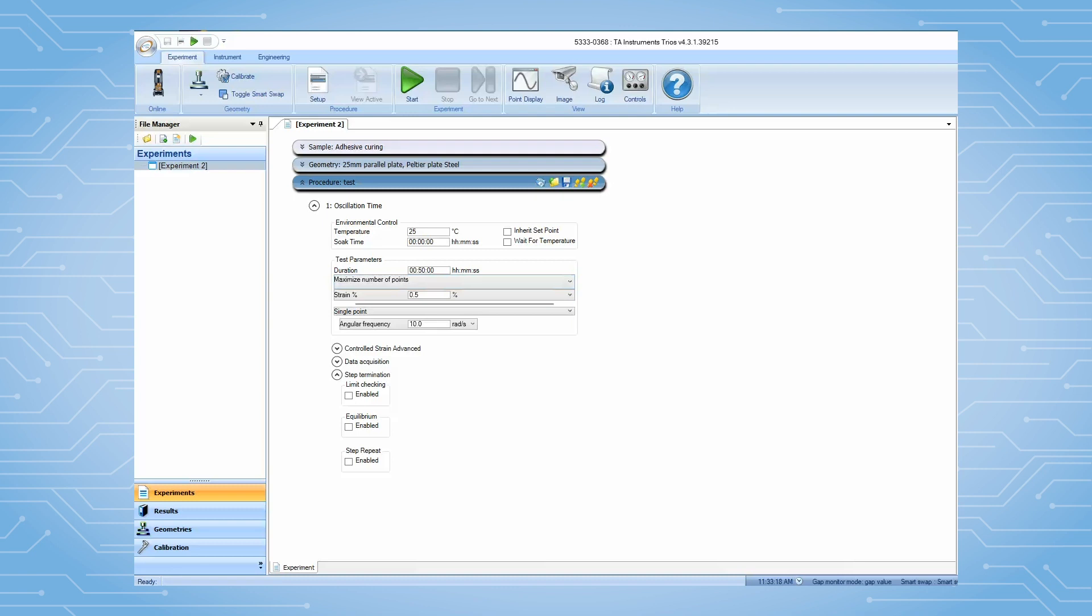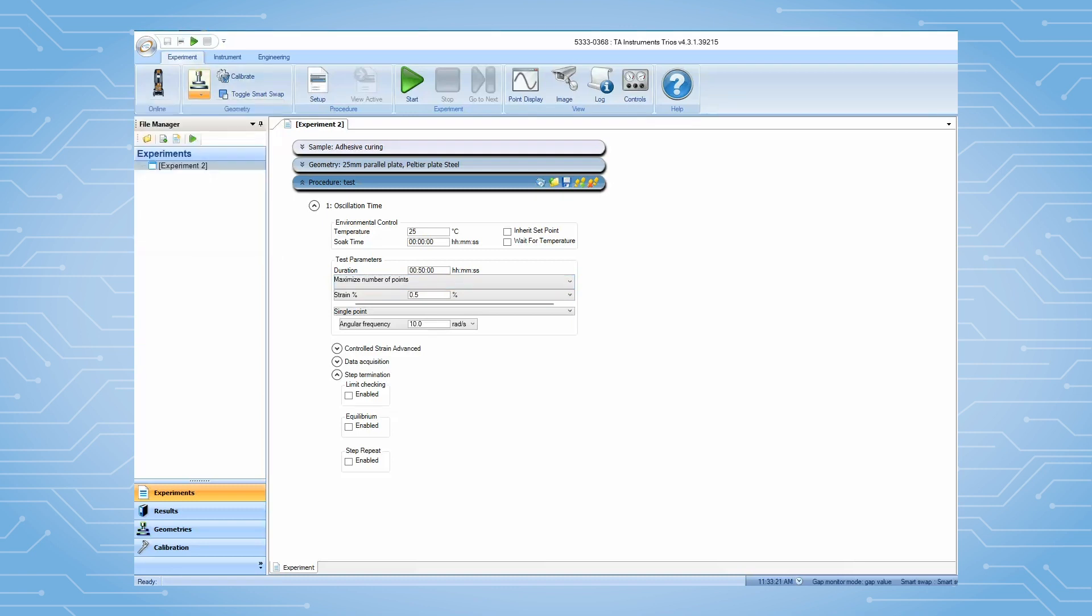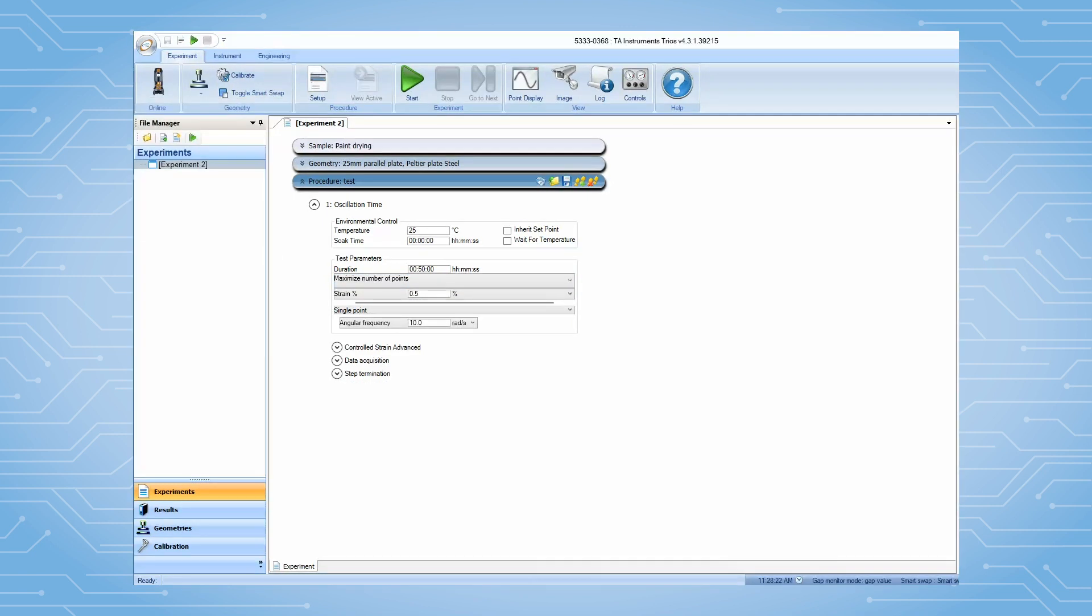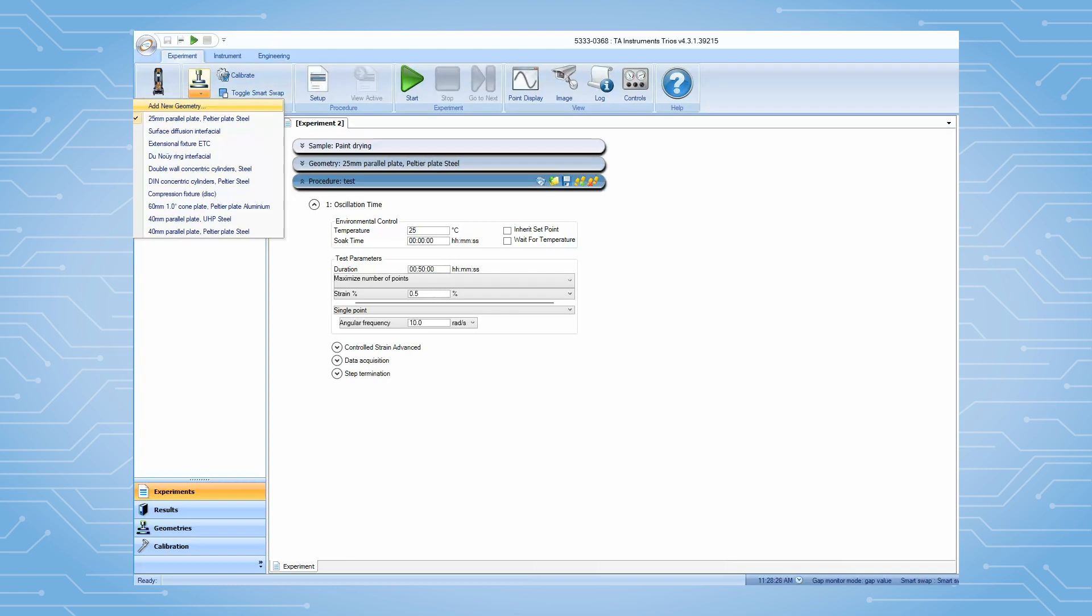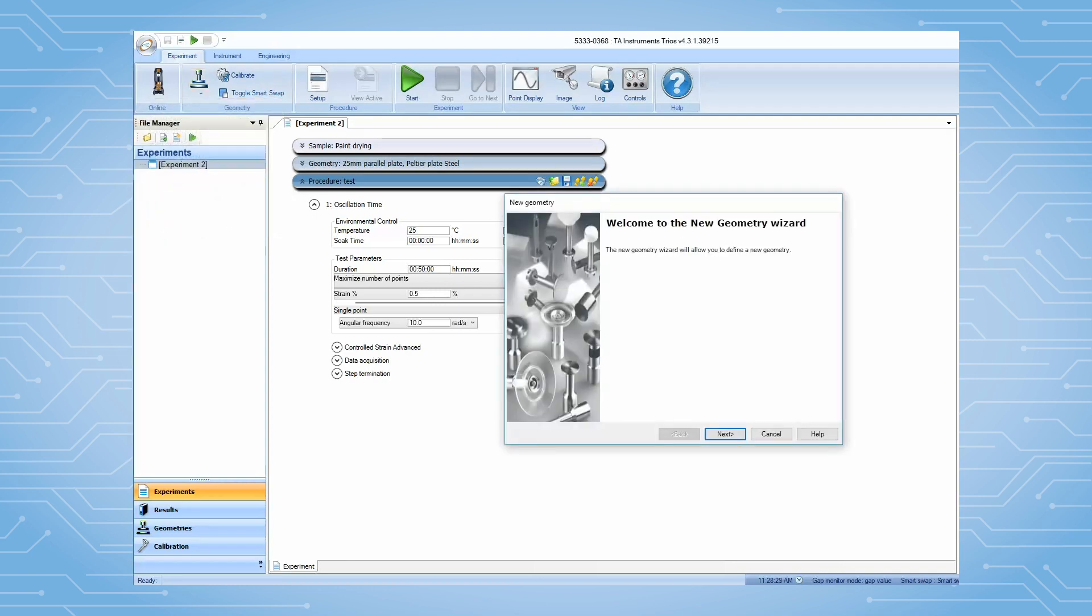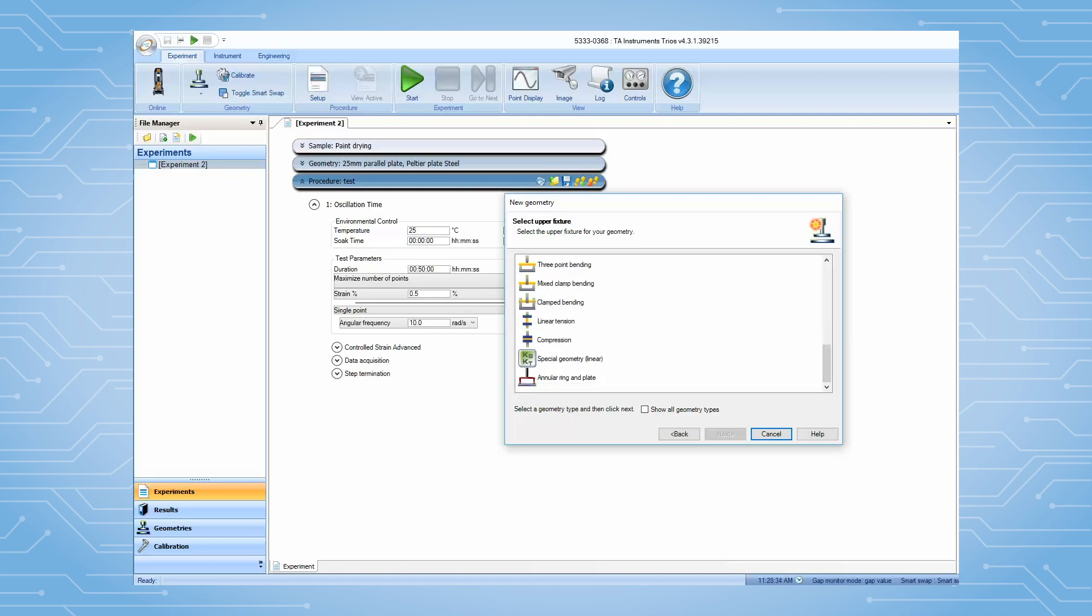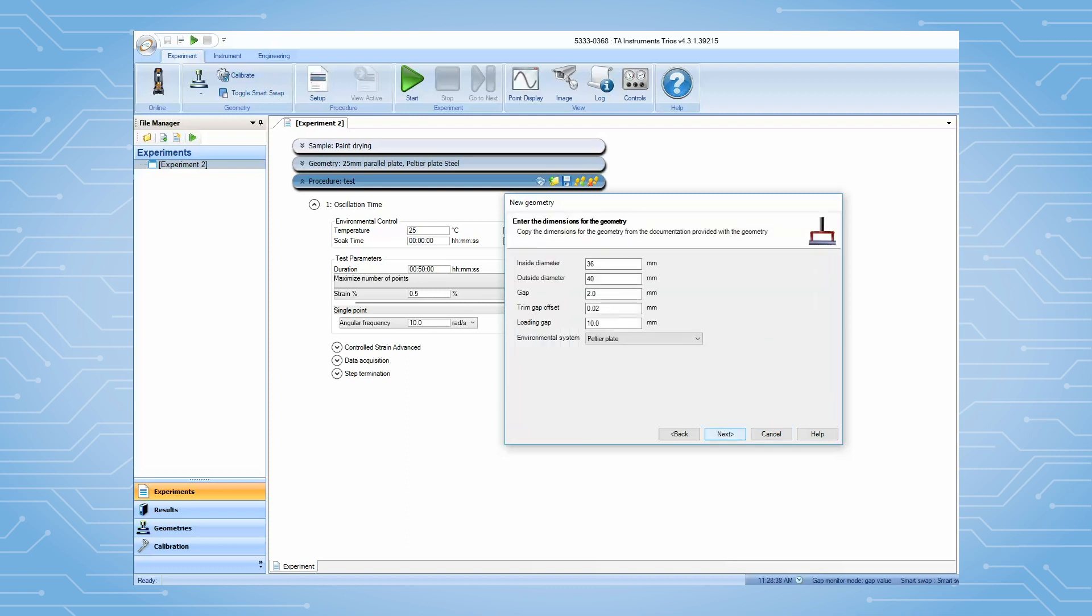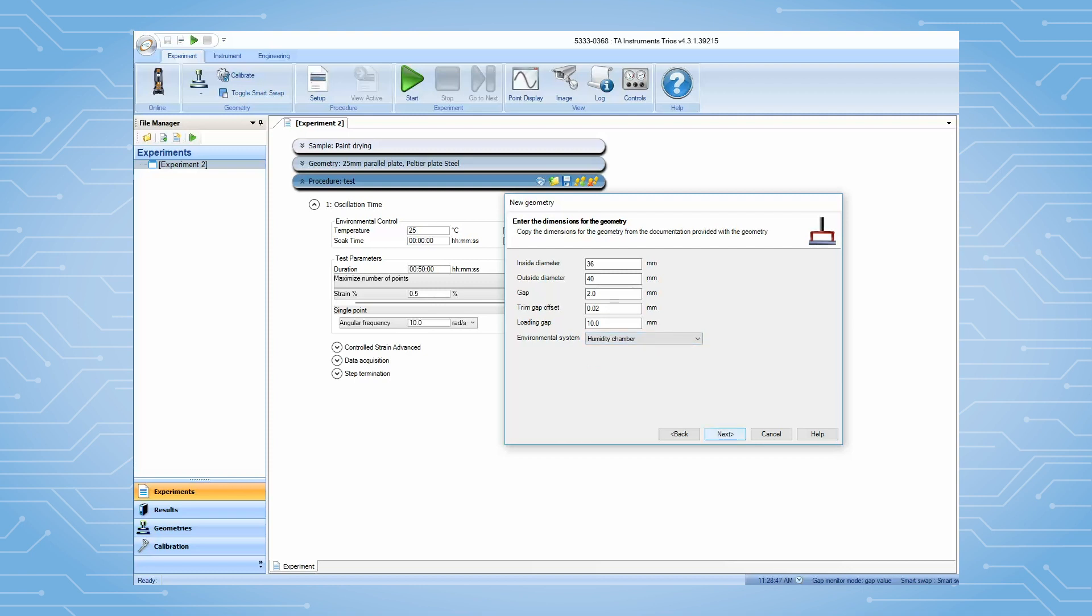From TRIO software, open the annular ring geometry file. If this geometry file has not been previously created, then select Add New Geometry. Under the geometry list, choose Annular Ring and Plate. Leave all of these parameters as the default values. Select Humidity Chamber as the environmental system. Follow the instructions to finish creating this geometry file.